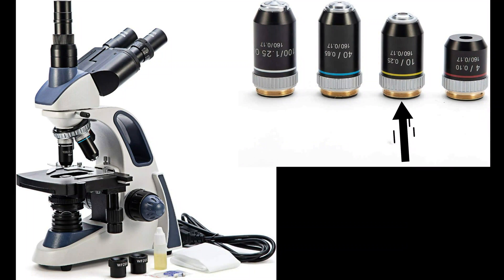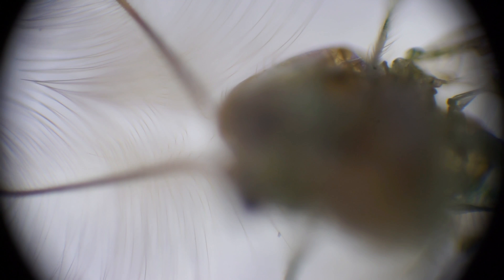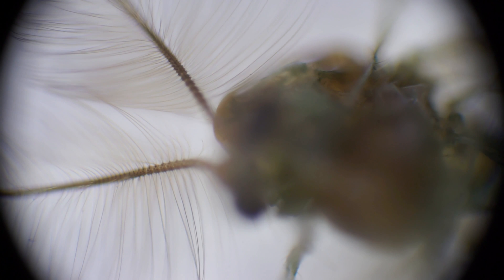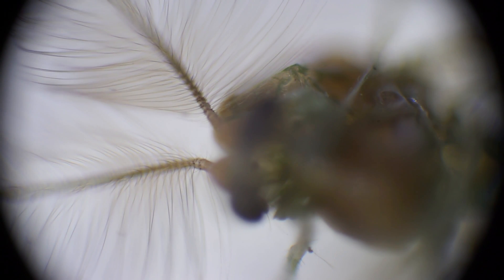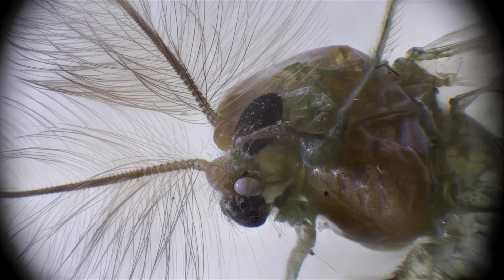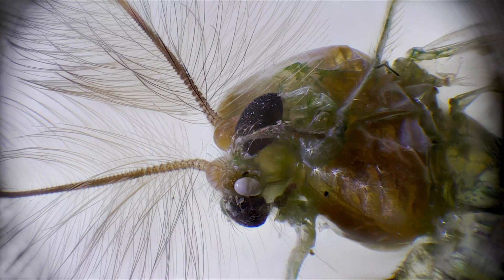Now let's continue to zoom even more. We move to the next ocular and do the same process — a short video clip focusing through the whole depth of field. As you can see, we are zooming in on only the head of the insect. Here we can see its eyes and the feathers it has on top of the head, and this one might be the nose — I'm not sure. After stacking all these frames, here is the result. I like this result. I removed the dark corners and added color, contrast, and a little more sharpness in GIMP.